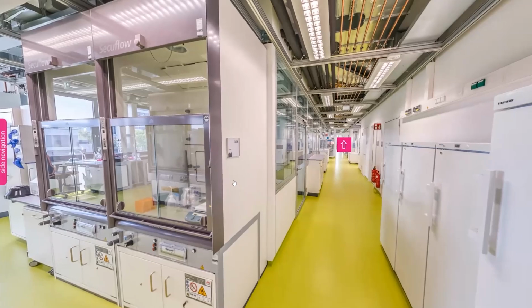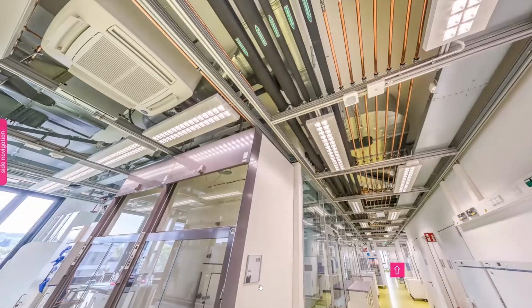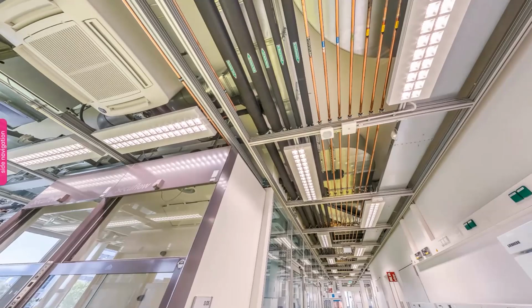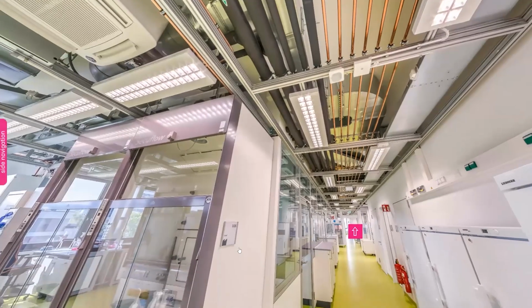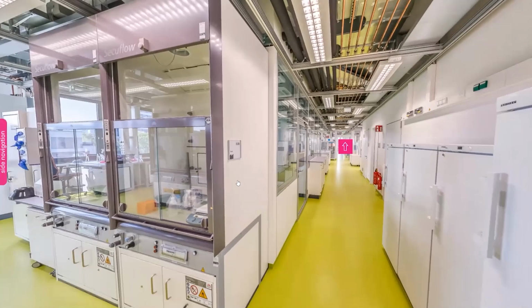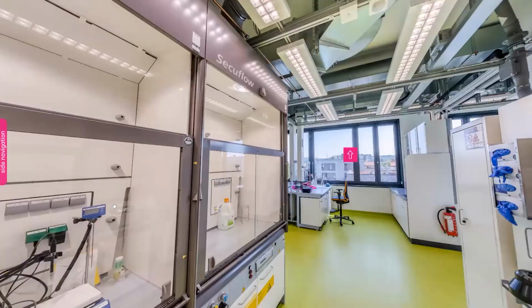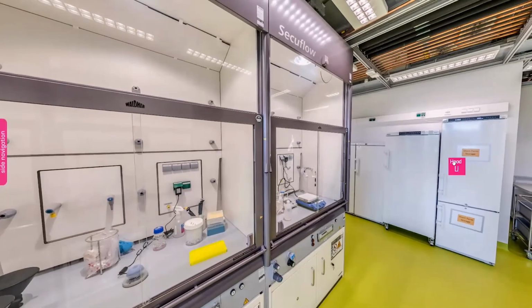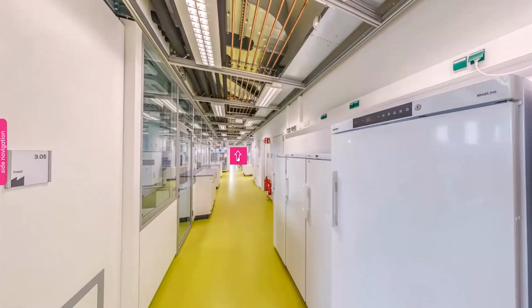Exactly. I would add, you see over there, over the ceiling grid, the service supplier. And it's sure that there are certain limits in the whole lab, because it's not possible to change a microbiological lab like we find here into a wet chemistry lab. You have four fume hoods per floor. It's possible to adapt, I think, three more of them, but that's then the end. In the general planning, it was defined for one part of investigation, and in this boundary you can do everything.